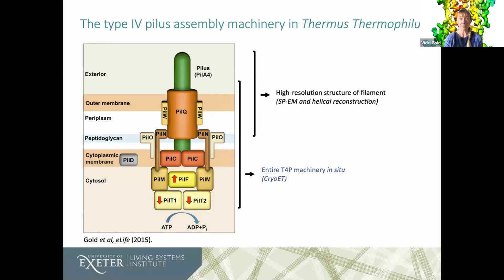So I'm going to talk briefly about my first project in this system, which was to study the entire type 4 pilus machinery in situ by electron tomography. And this is the work that I carried out as a postdoc. Now, I wasn't going to give any background to the methods for this audience because I didn't think it would be necessary, but then when I swapped sessions and became one of the first to speak, I thought I'd better put in a little bit of methods, at least for those who are new to cryo-EM in the audience. So it's very brief.